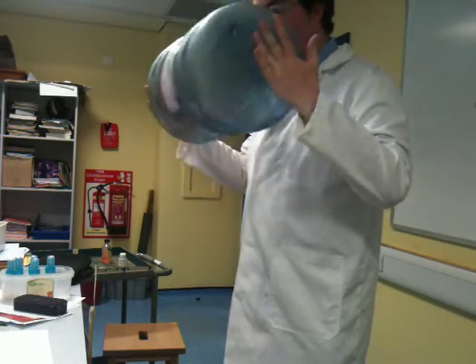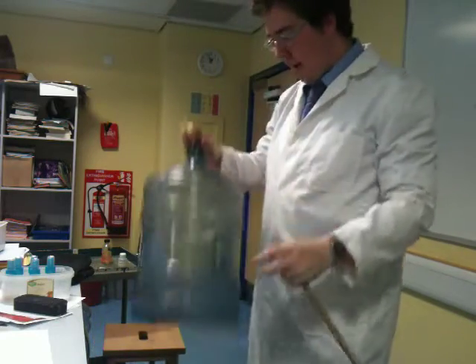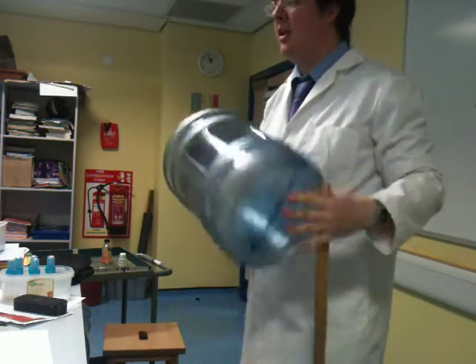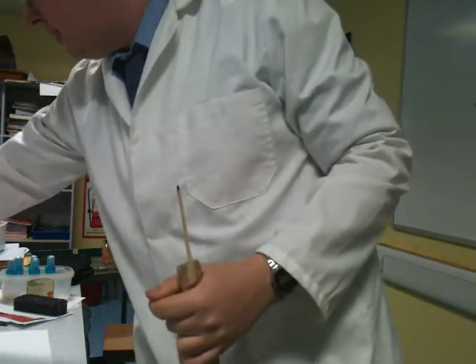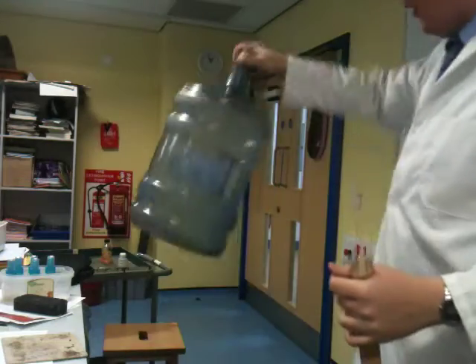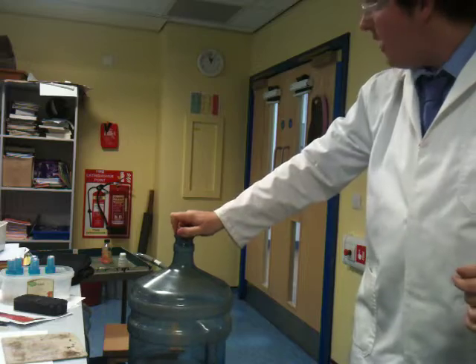In a second, using my match on a stick, I'm going to light the top of this, and hopefully you should see a nice subtle flame. Make sure that's out of the way in case this goes a bit out of control. I'm going to turn the lights off so it's slightly easier to see. Right, pay attention — that's closed.